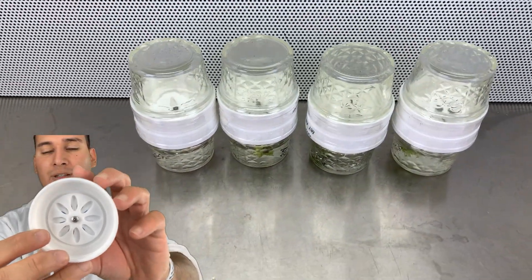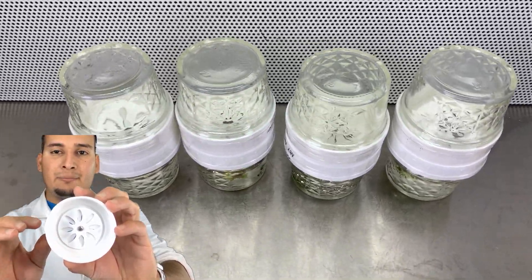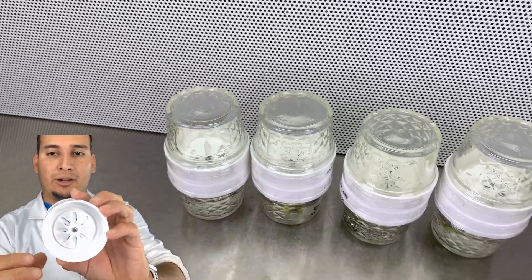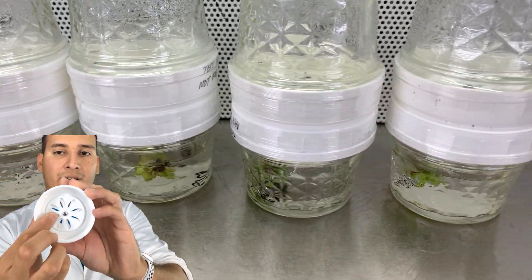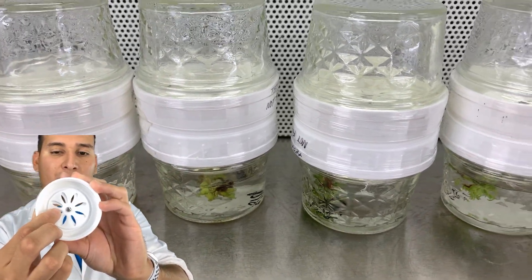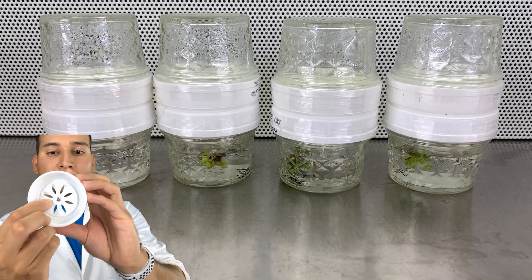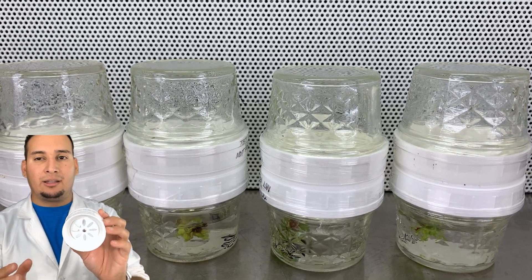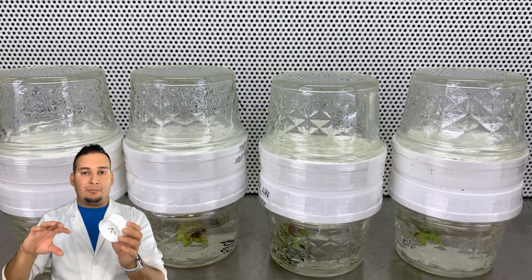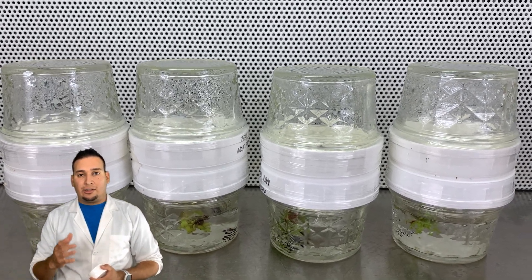What happens is that if you fully close it as much as you can, the media can still go to the side, but it creates a little bit of vacuum where the media moves very slowly. So you want to open it a little bit more. If your plants are big enough, I really recommend keeping it fully open — this is the best way to make the media move faster.